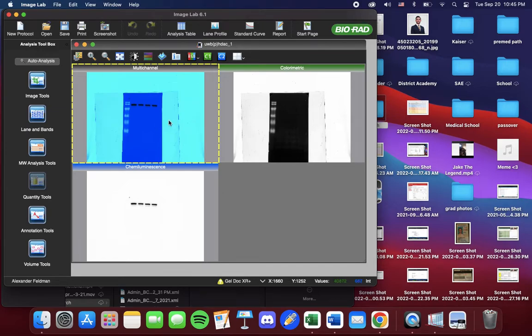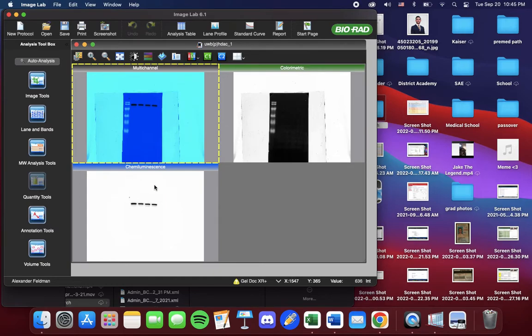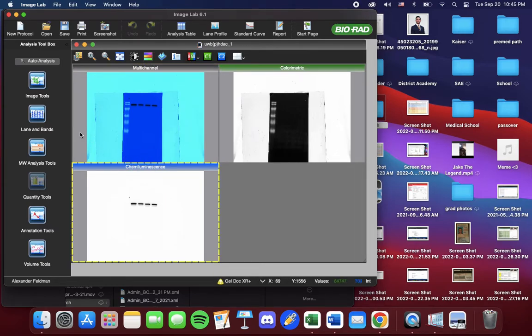Now we have three different blots in front of us. We are going to be using the chemiluminescent blot. So we select it.